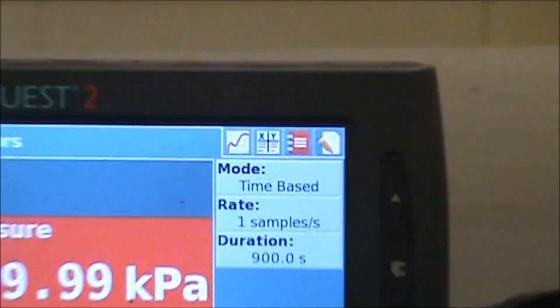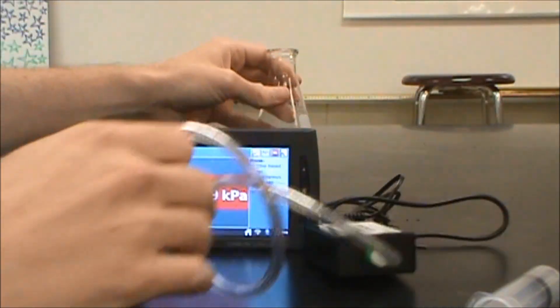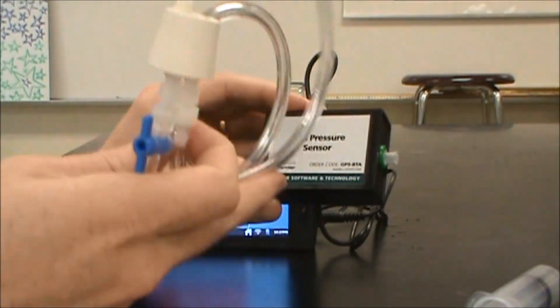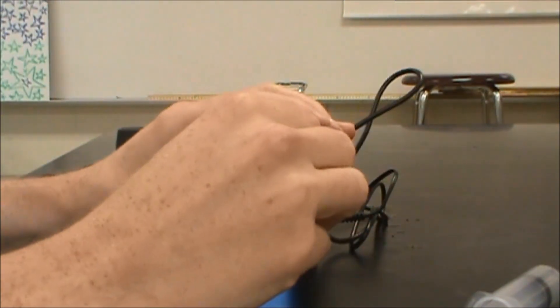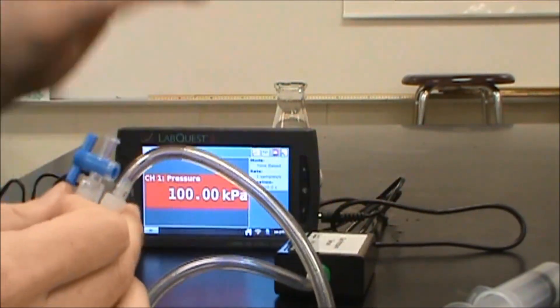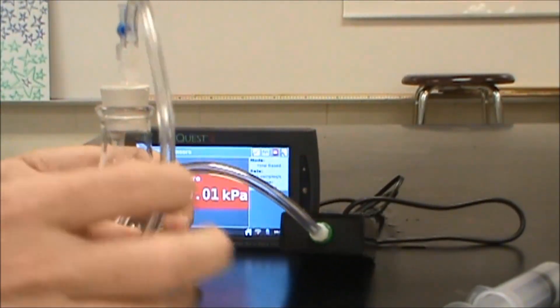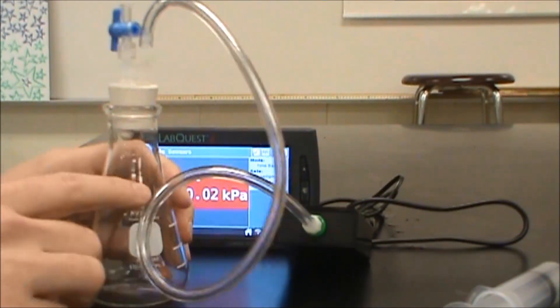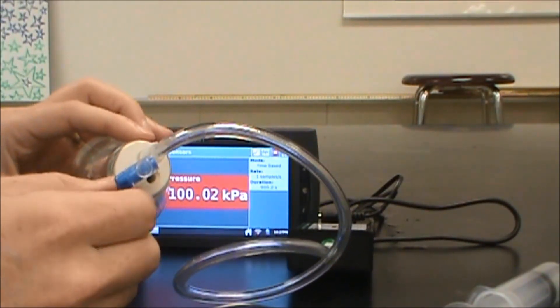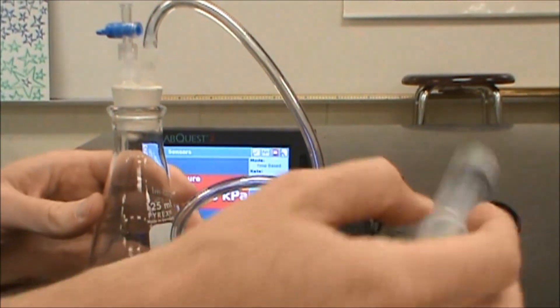For our final experiment setup here, we've got my LabQuest 2 and I have a gas pressure sensor. I'm going to hook up this apparatus to it. I'm going to be very cautious not to exert too much torque on this because I don't want that to break. Then I'm going to plug this end into my Erlenmeyer flask securely. This is now reading the pressure inside of this. Currently I have this blue thing here parallel to the opening. That's allowing air to go in and out. It's open to the atmosphere. If I close this, that's going to seal this off. Now I have a closed system.